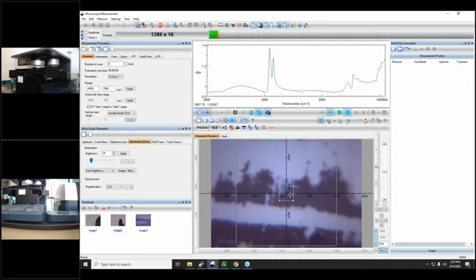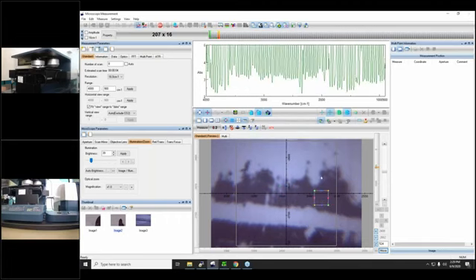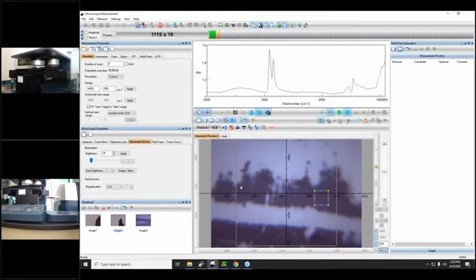So this is my aperture, and this area here that is something like 200 by 200 is the area where I can scan. You can see in this spectrum that we have the signal of one of the polymers. If I move it here, this area looks a little bit dark, and it's dark because it's in contact with the sample.